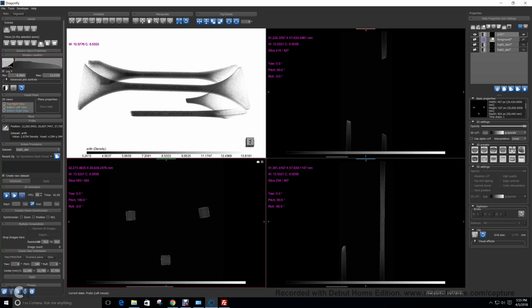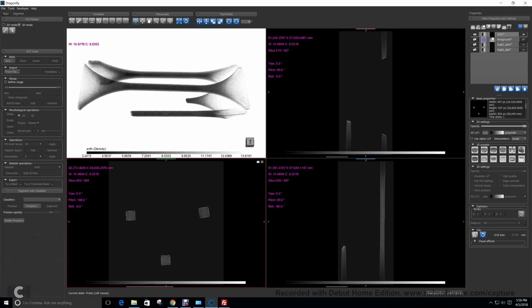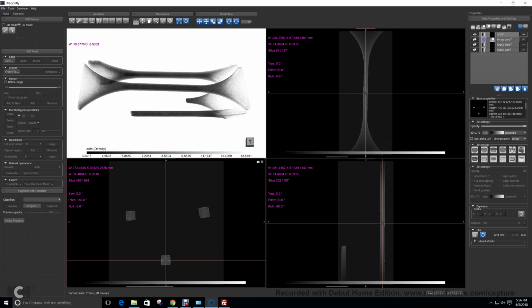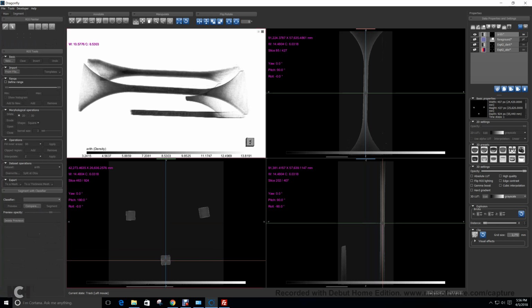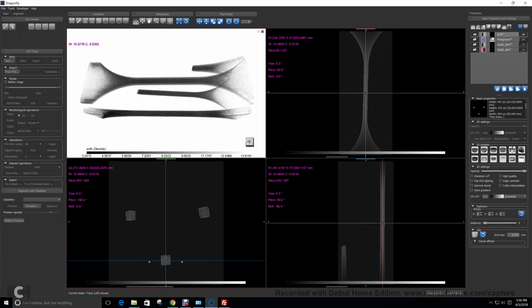And next step, the final step, row 7, is line probe slice analysis macro. So we click the array. Here we have interest in the stressed sample. This one.